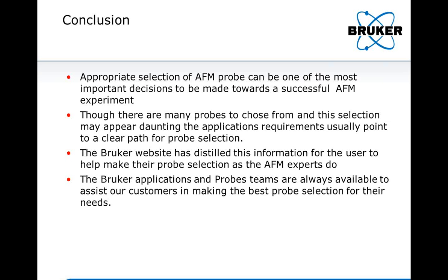While using MLCT tips, which are the tips that have multiple cantilevers coming off the edge of the die, the question is, do you cut off the extra cantilevers or leave them on the chip, if you're doing cell imaging? And if you in fact cut them off, how do you cut them off?